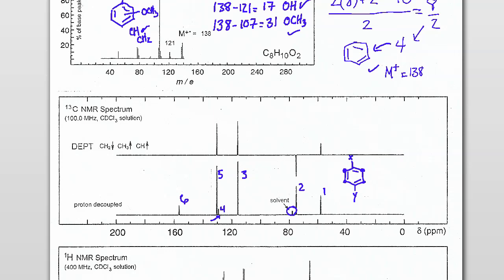So where the carbons on the ring where we put the X and the Y group, those would be the 2 carbons that are disappearing in that case. Right? The other 2 represent the sets of symmetrical carbons. So that makes sense so far.